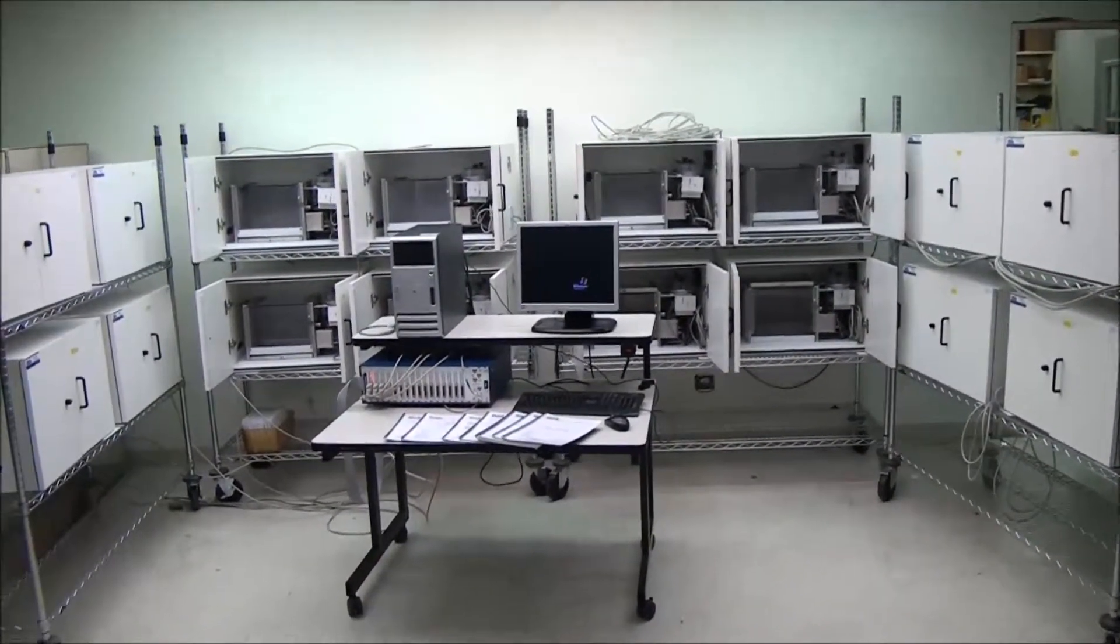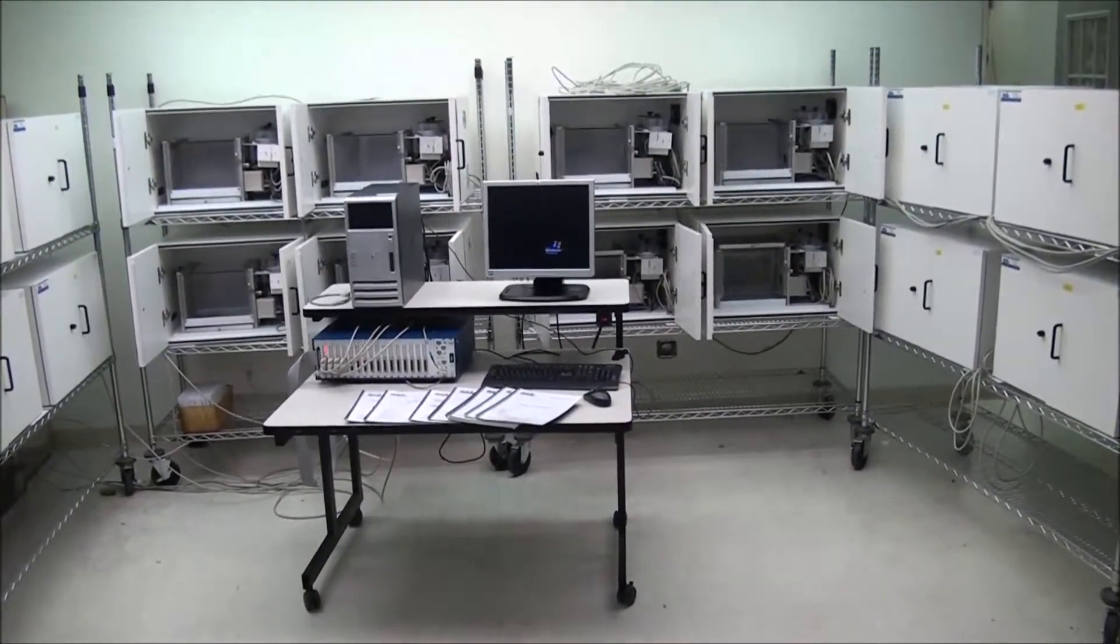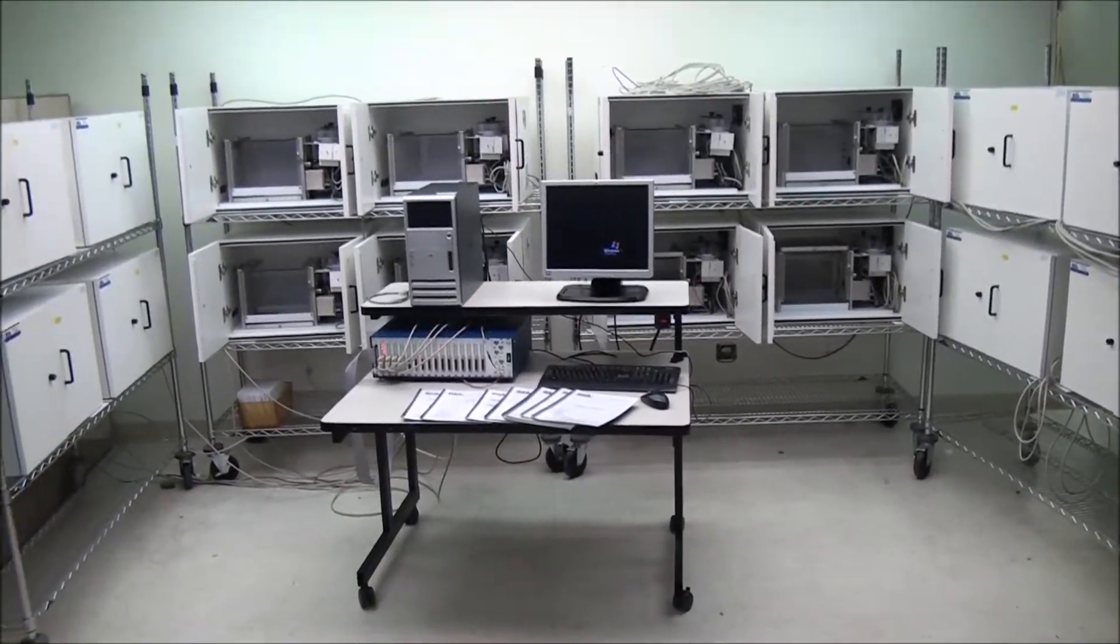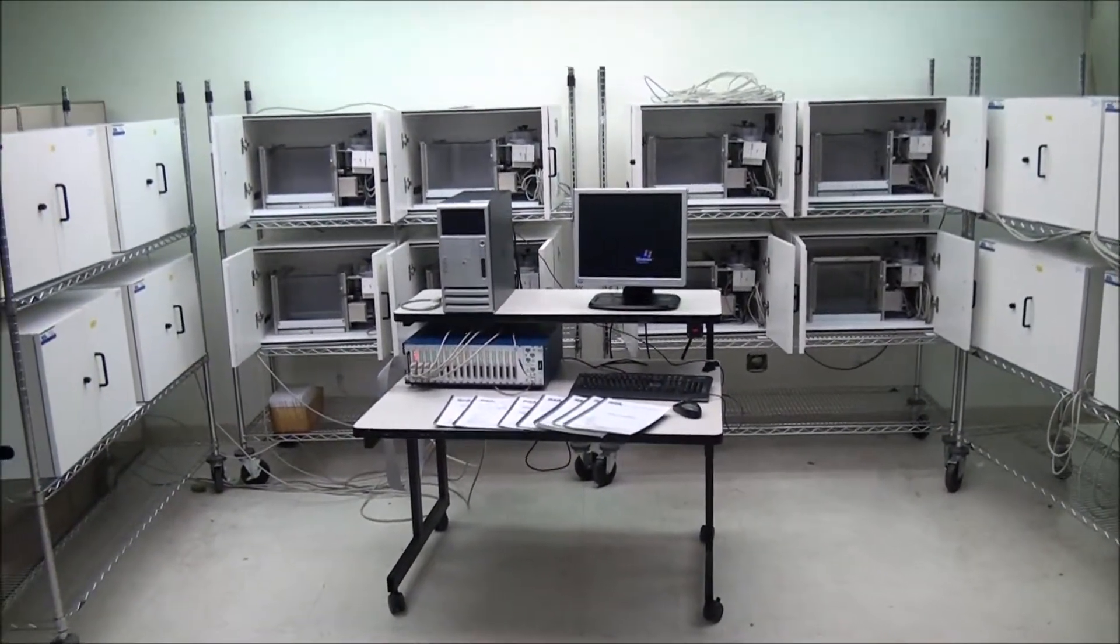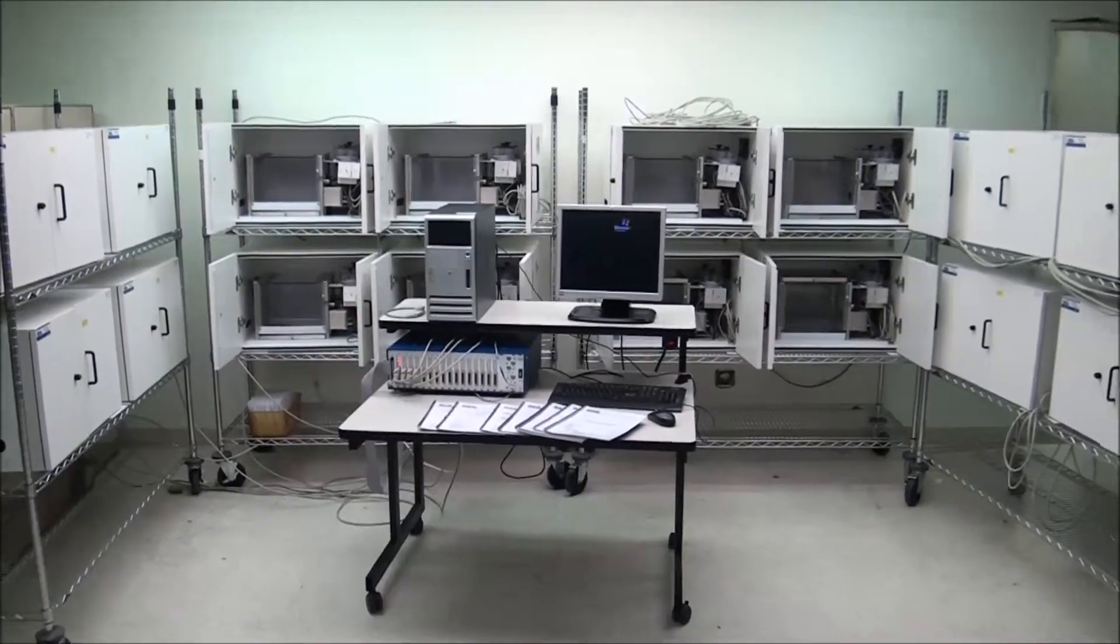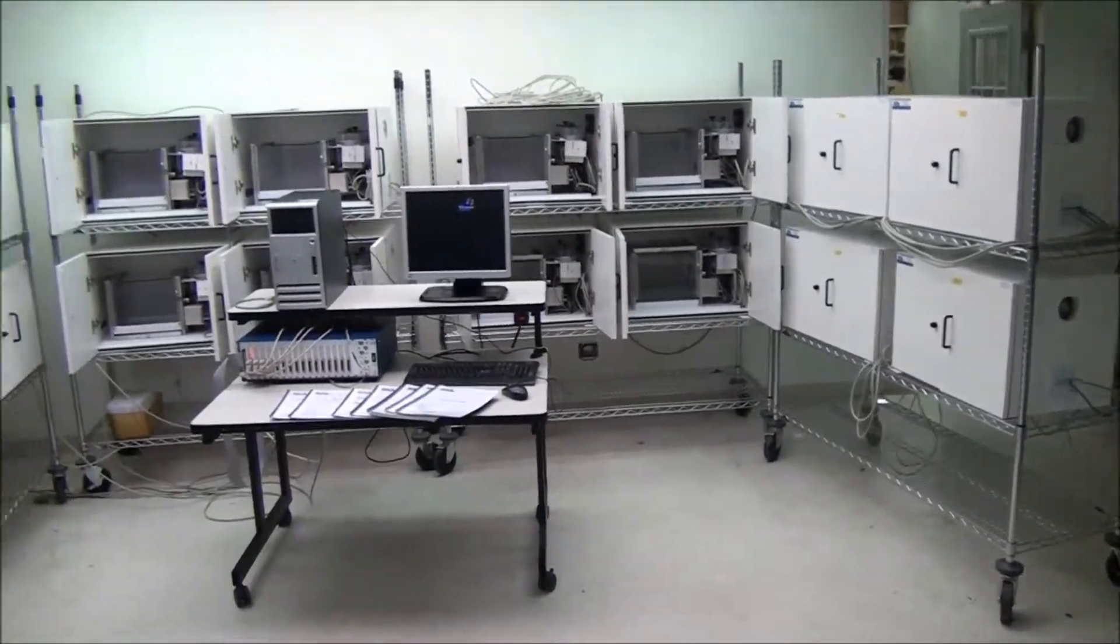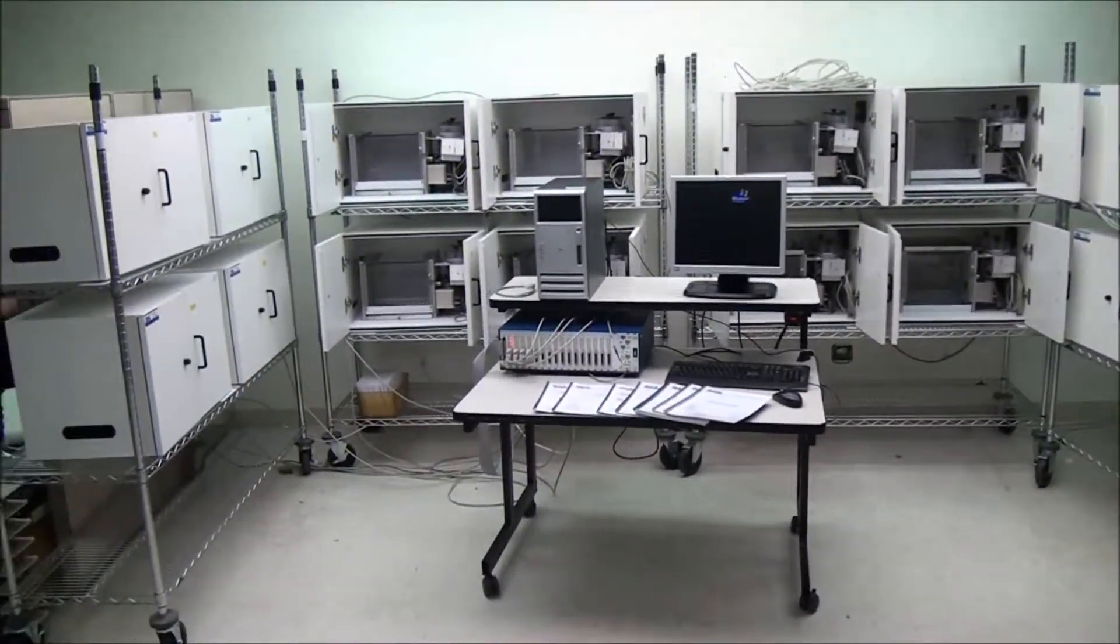Hi, this is Rich at New Life Scientific, and today we've got a really big MetAssociates rat monitoring chamber system that has 16 total boxes here.